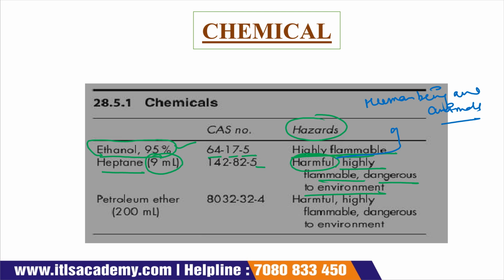So when we are using this chemical, we have to wear proper gloves, so it will not come in contact with our eyes. And also we have to avoid breathing in this vapor. Okay, so this is the hazard related to the heptane.